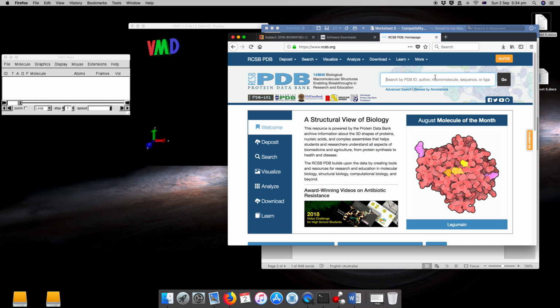Now, there is some information here. You can see that it comes from the organism, which is the chicken. It is solved through X-ray diffraction to 2 angstrom. And also we have the literature, the publication where this was published. We also have some chains, the sequence length.